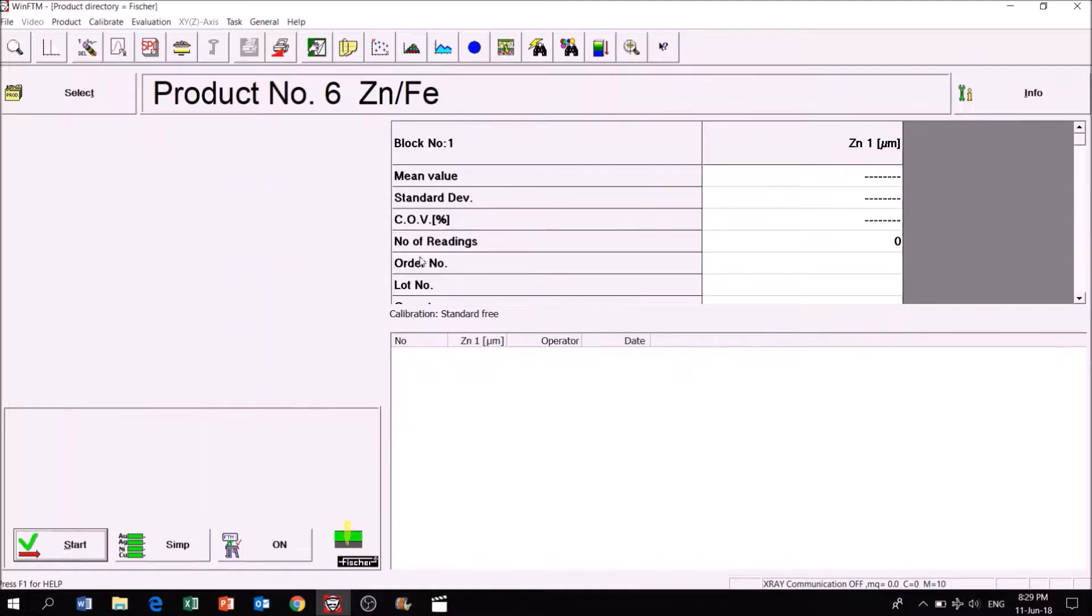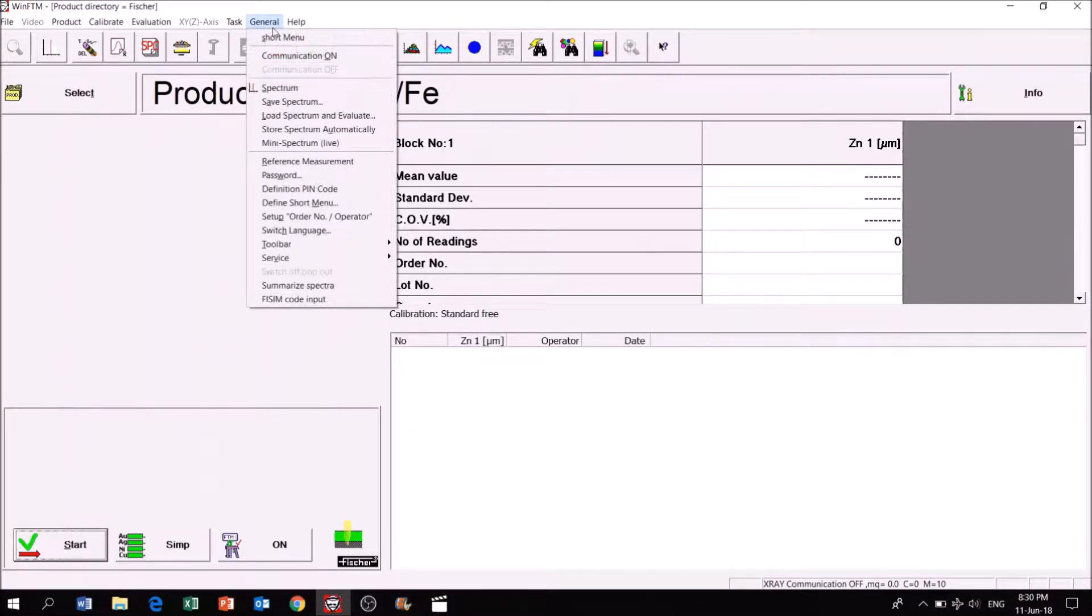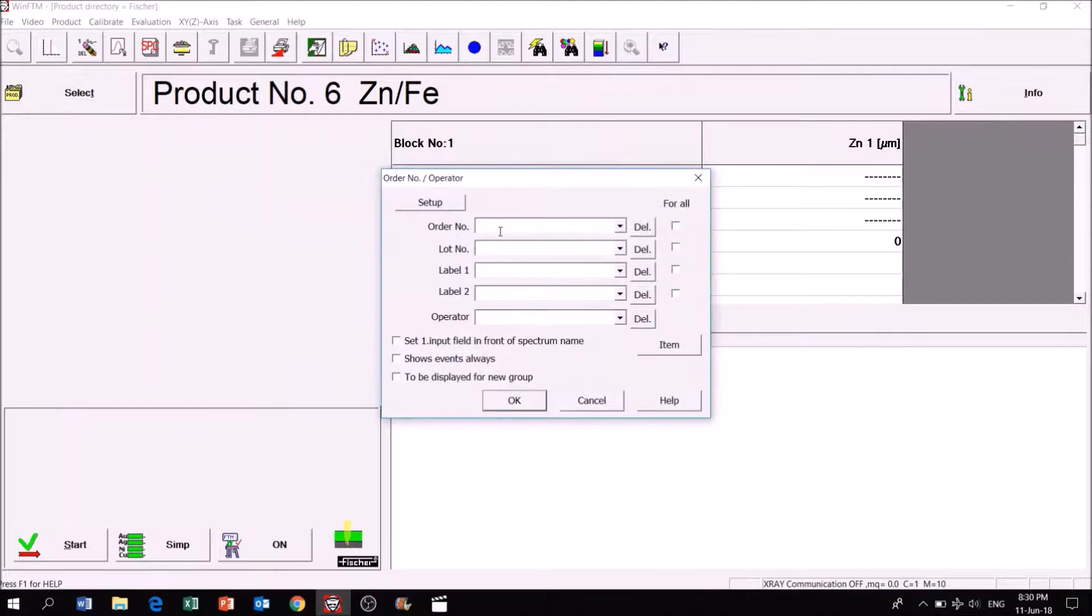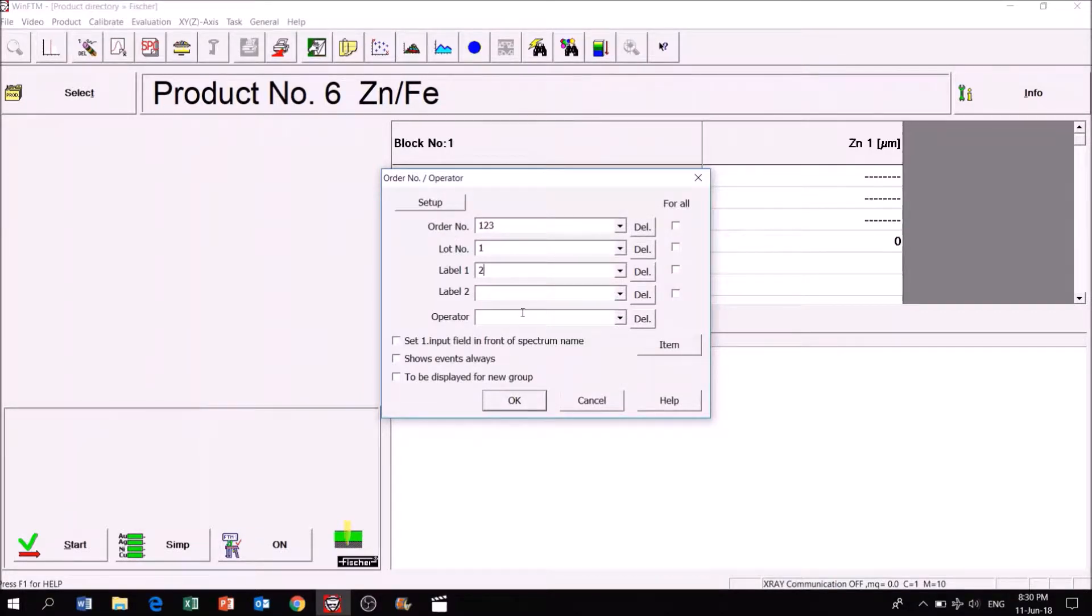Next, click on General followed by Setup Order Number/Operator to fill in details such as Order Number, Lot Number, and Operator Name.